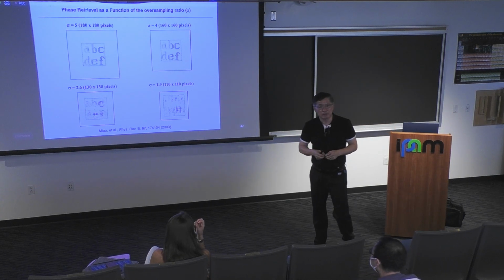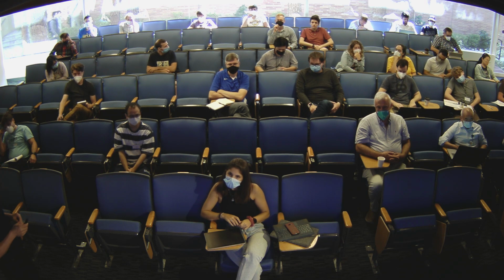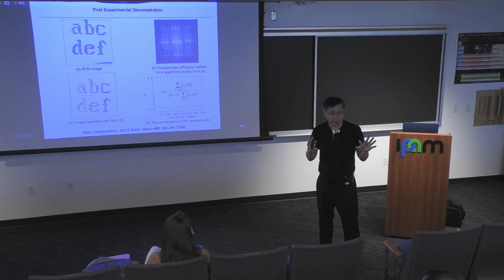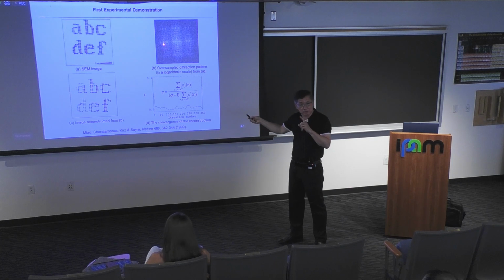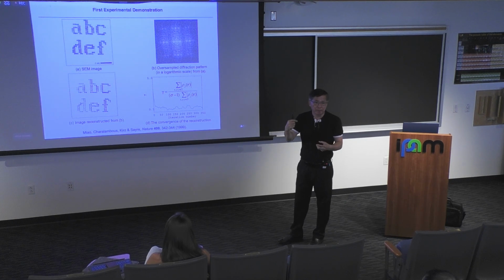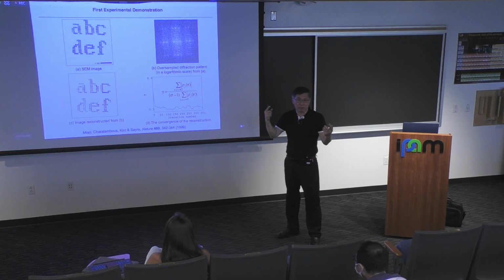You said you measure the diffraction pattern, but then in order to get these images, you do a discrete Fourier transform, right? So if sigma is small, you get errors on the periodicity of the Fourier transform as well. In our iterative algorithm we always use FFT, we don't use DFT, which means we undersample. In order to change sigma, we have to undersample, for example with 2 by 2 binning, which reduces sigma by a factor of 2, or a factor of 4 actually. You bin 4 pixels into 1.